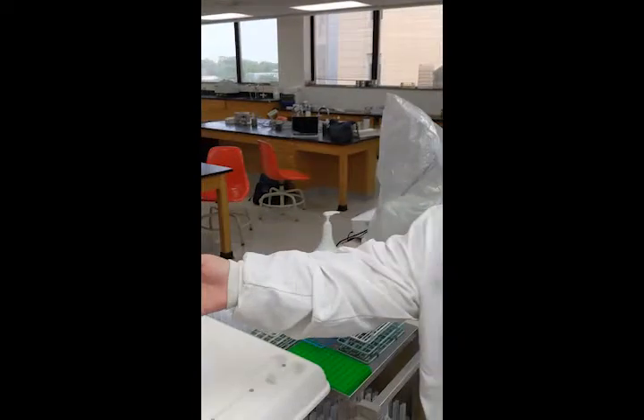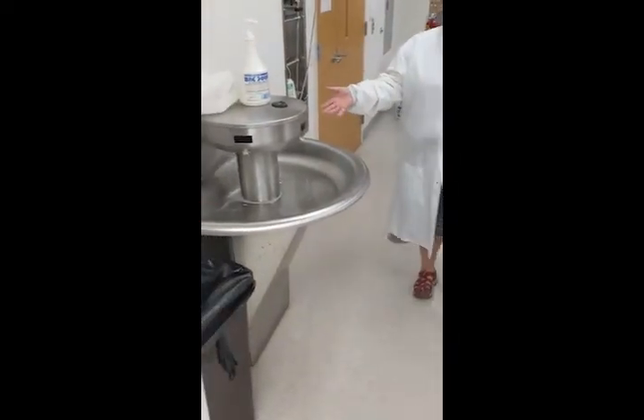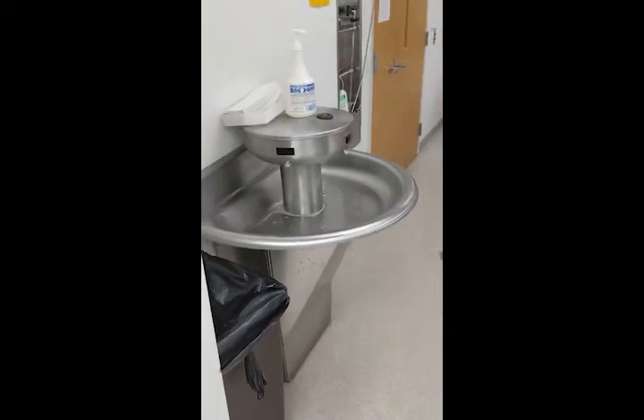The next thing you need to do is make sure that you wash your hands before you leave the lab. Our lab has three sinks, so there is absolutely no excuse for not washing your hands.